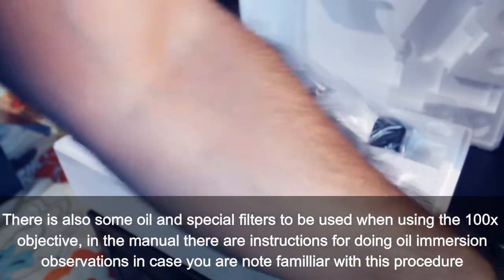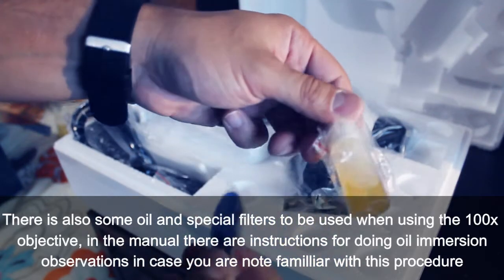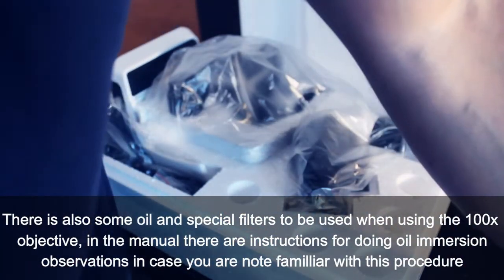There is also some oil and special filters to be used when using the 100x objective. In the manual, there are instructions for doing oil immersion observations, in case you are not familiar with this procedure.